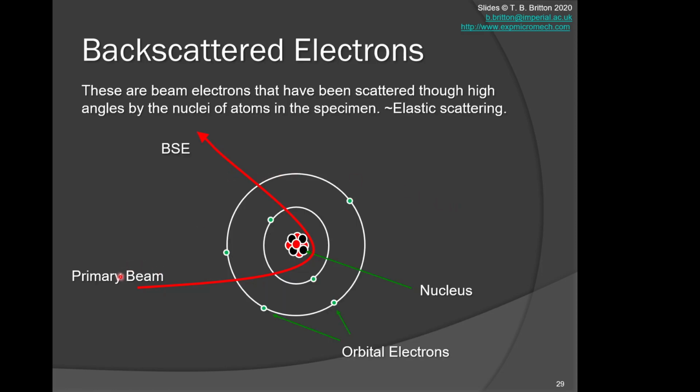The backscatter electrons, broadly speaking: you have the primary beam. If it hits the primary nucleus and reflects, there are effectively some small plasmon losses. That's your primary backscatter that has those near elastic scattering events. But you can also get that backscattering due to the interaction with the electron cloud, and so it will zoom back, but it's the primary electron that you're signaling. So this effectively will only lose electron energy from the primary beam due to some small scattering as it changes course and comes back.